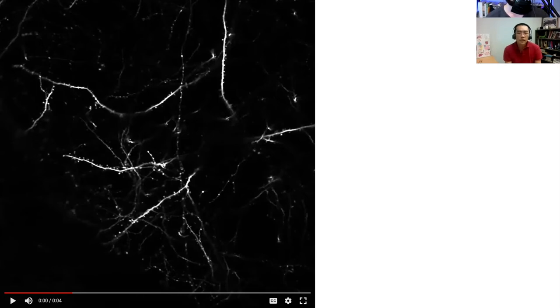Right. So as I mentioned, a dendrite probably contacts thousands of other neurons. So those little knobs coming out of the dendrites are what's known as the dendritic spines. Most of those dendritic spines are the site of connections for this neuron. The majority of them would contain an excitatory synapse, which means that another neuron makes a connection there and has a possibility of exciting and depolarizing this neuron. Some of those dendritic spines might also be immature dendritic spines. So they have the shape and may become a mature connection, but they're not yet a functional connection. But this is kind of structurally how one could see the connectivity of these neurons and what may be the sites of the connections.